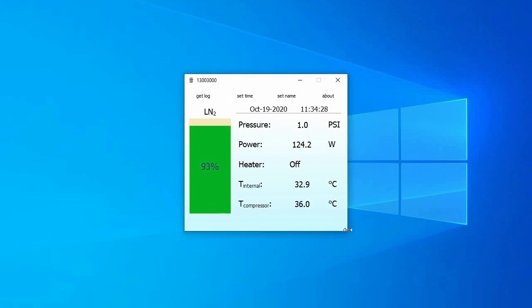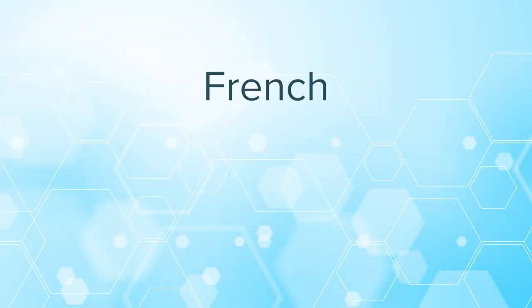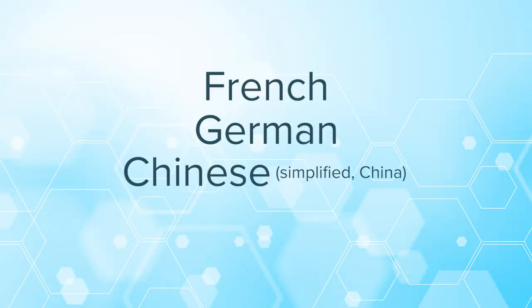The standard application is released in US English. Note, however, the design is such that translation to French, German, Chinese, or Korean can be easily supported. Please contact your local Mirion representative to check on this language support.